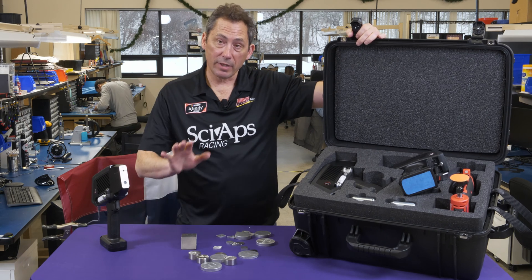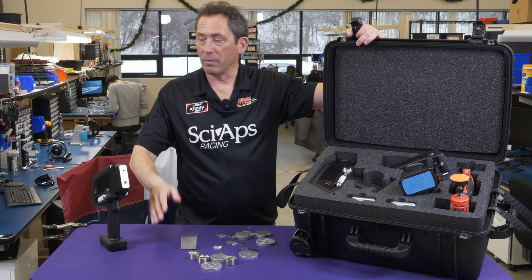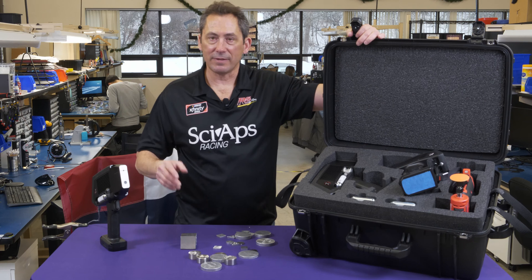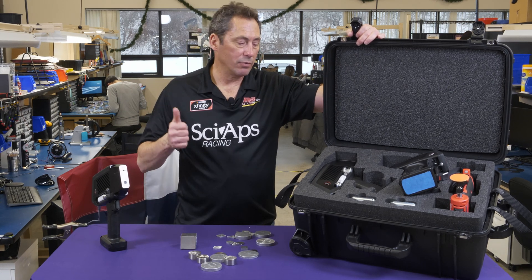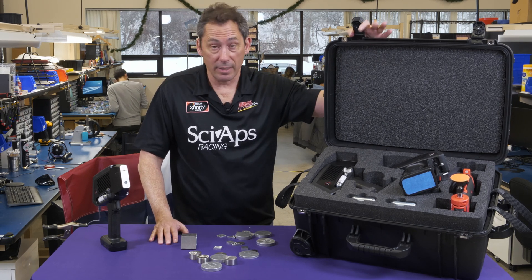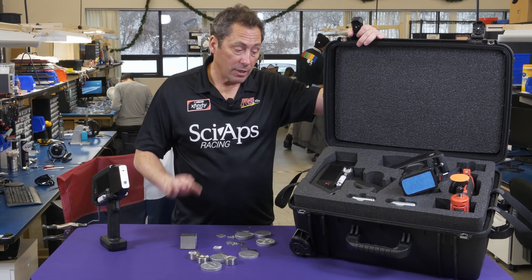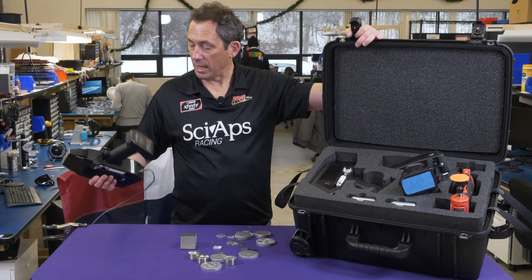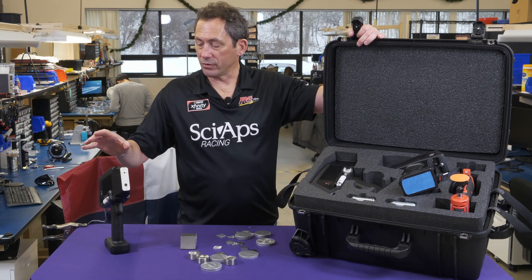Why do we do that? Because as you know, X-ray is just really great for metals — chromium, nickel, molybdenum, cobalt. X-ray is great for shooting metal; it's fast, easy to use, and doesn't require much training. But it doesn't do carbon — a few other elements too, but let's focus on carbon. It simply does not analyze carbon. So if you wanted to measure carbon, some customers like the idea of a carbon-only LIBS unit like this, which is now about a half a pound lighter and smaller, and it measures only carbon.